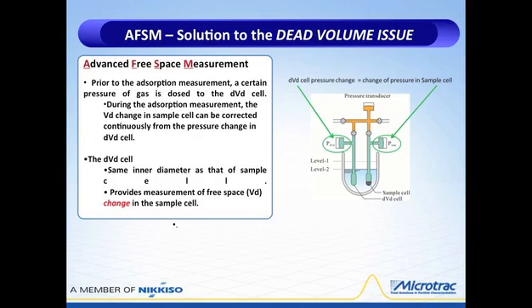And anything that's happening to our sample over here, whether the liquid level drops during the measurement and this pressure is changing, that will happen also to our blank tube, where the pressure will drop to the same amount that our sample's experiencing. So what we actually experience over here with our sample is pressure changes that are occurring as a result of adsorption by the sample, and also in addition is the change in the level of the liquid nitrogen.